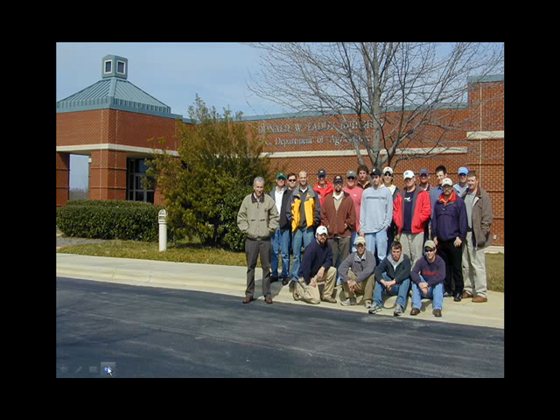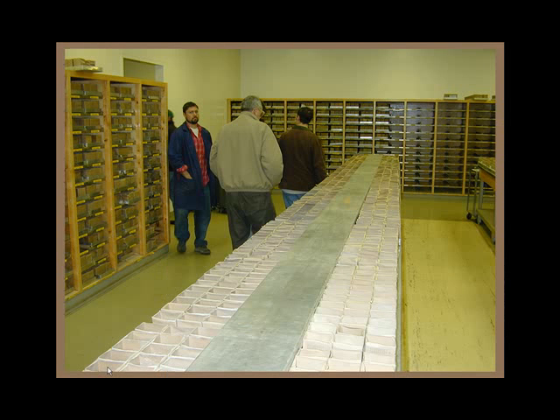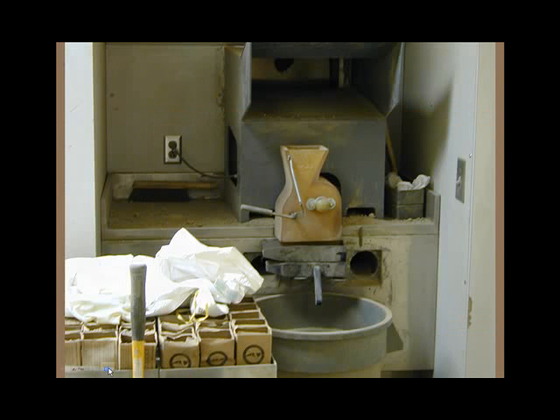There's the lab. You can see hundreds and hundreds of soil samples day after day. They all start here. This is the grinder. The soil is dumped into this grinder, and it comes out back into the box. So it's made to a uniform size, a size that will dissolve best for the analysis process. From there, a mild acid is added to the soil, and it's made into a solution. That's a soil solution that simulates the soil solution you would get in the soil as best possible.